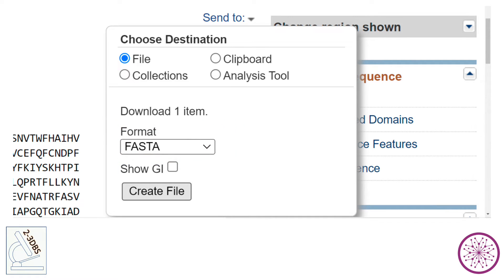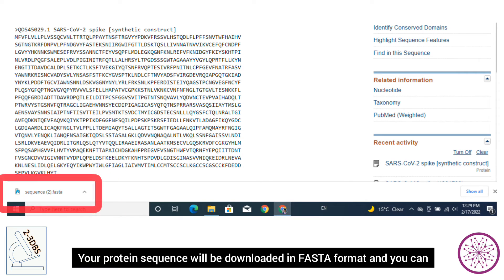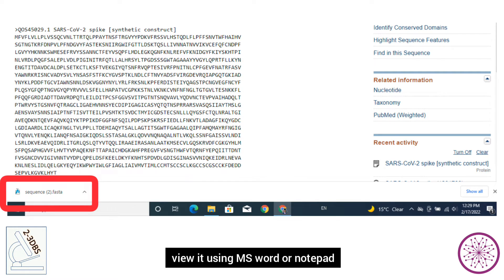Then click on 'Create File'. Your protein sequence will be downloaded in FASTA format, and you can view it using Microsoft Word or Notepad.